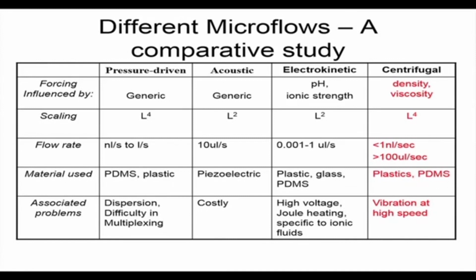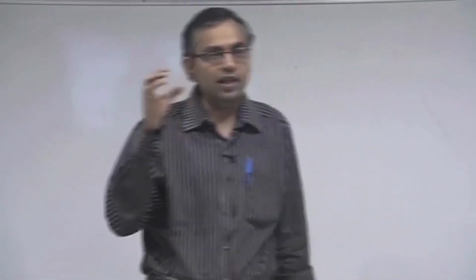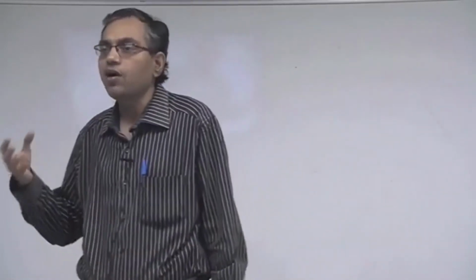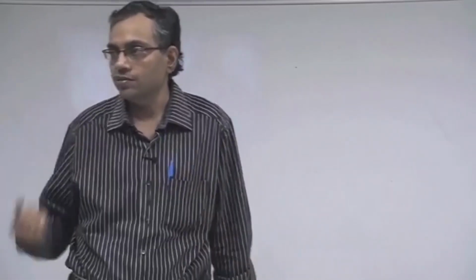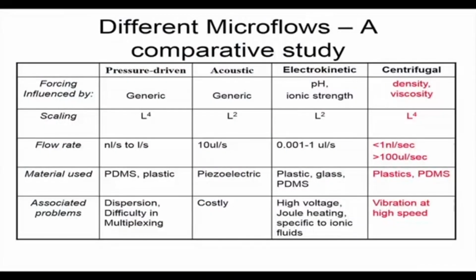Like I have discussed this earlier a little bit, if you have a parabolic velocity profile, and you want to achieve a reaction at the wall of a microchannel, then because of the big difference between the center line velocity and the wall velocity, the fluid will try to carry the sample along the center line, and the wall may be depleted, or in very simple terms, the wall may be deprived of the sample which will react with the reactants present on the wall.